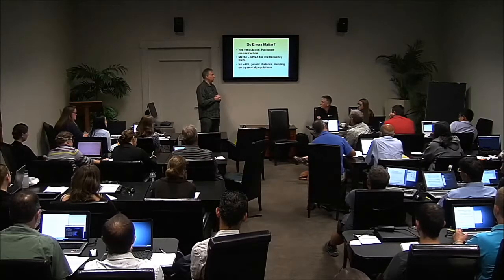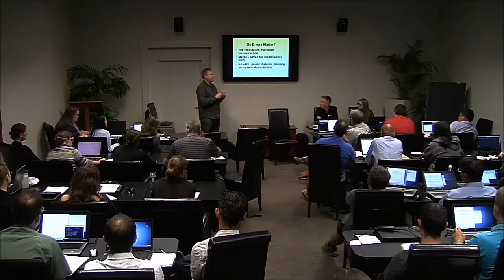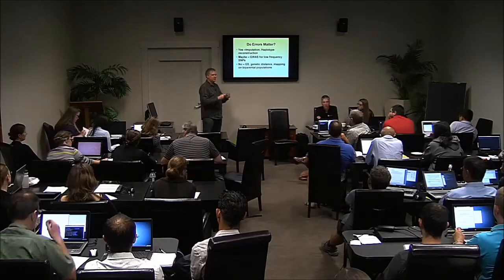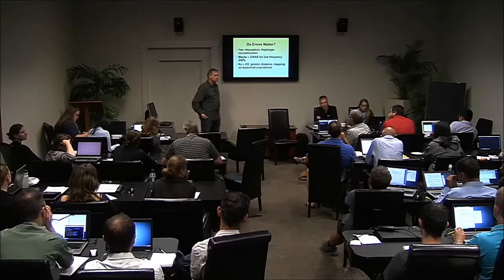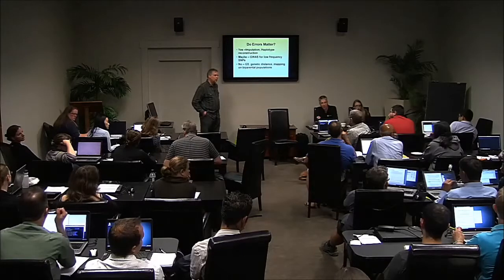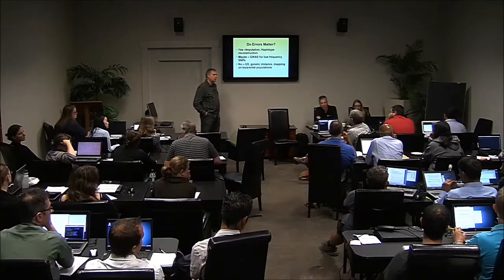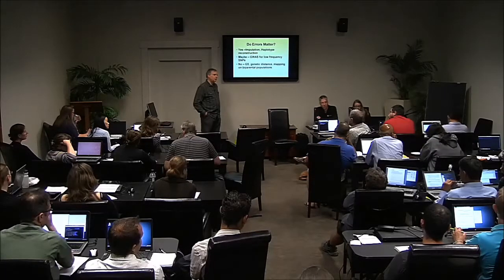Yeah, you could, or you could pull it right out of the TOPM, right? Everything that aligns together. But we don't necessarily have tools in TASSEL to do that. But it would be really easy to add that. Yeah, I'm just thinking about one application for your polyploid species with allopolyploids, where you can actually break down to subgenome SNPs and real SNPs would be a cool application.